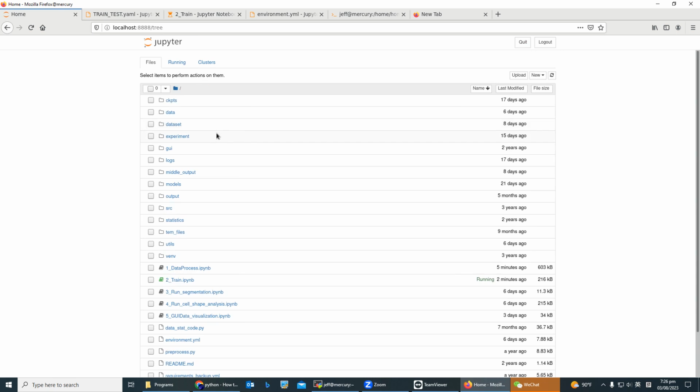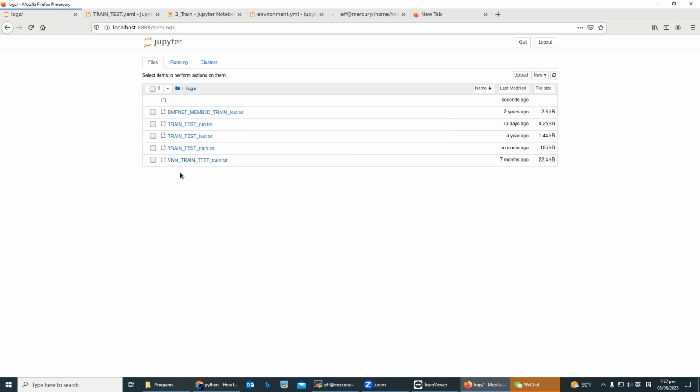And the training message will be saved in the log, and you can find it. The configuration file is the train text. So the training log is here.